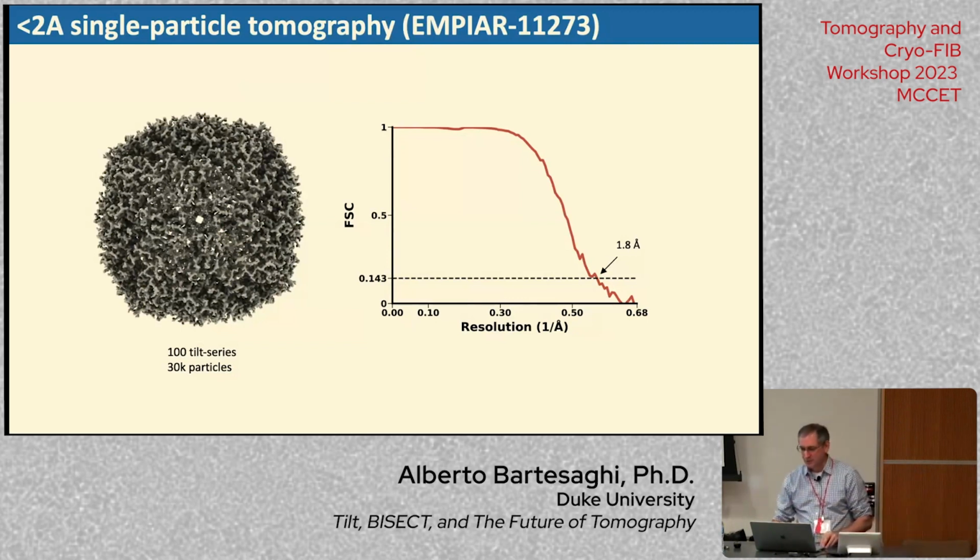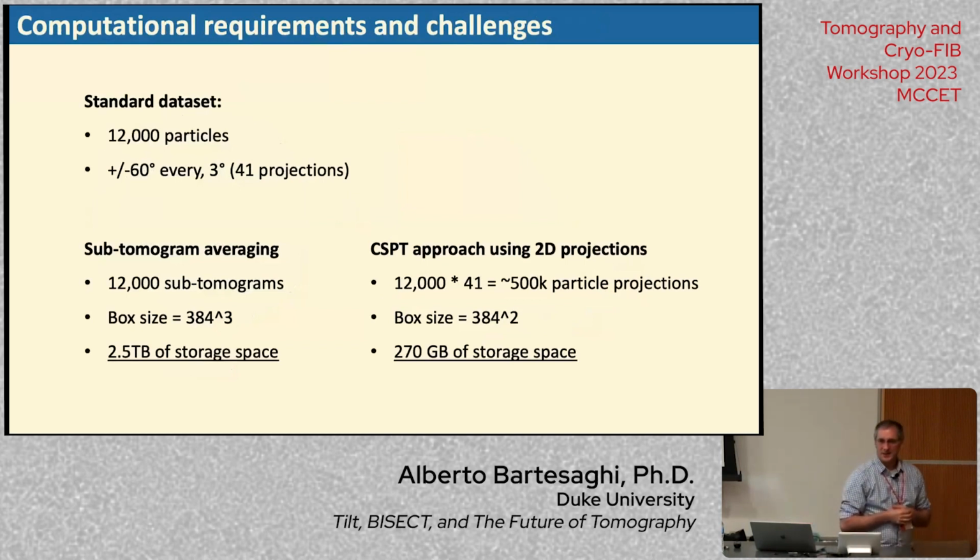And this will bring me to my next point, which is the things that are not wrong, but that we still need to work on in order to make cryo-ET a really useful and high throughput tool for high resolution analysis. I put these numbers up here just to give people a feeling for what are the things that we need to worry about. So you can imagine for a second that you have a data set where you collected 12,000 particles, which is not a very big data set, it's quite small, especially by single particle standards.